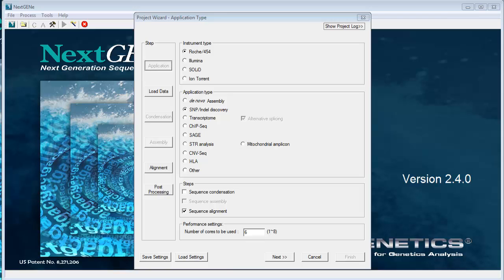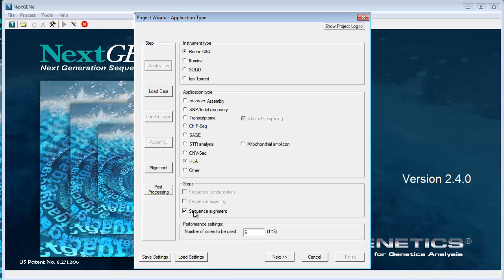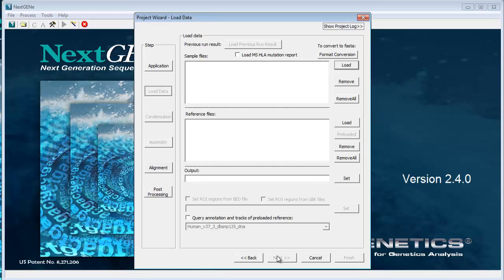To perform HLA typing with NexGene, select the instrument type that was used for sequencing and select HLA under the application type. Sequence alignment is selected under Steps. Click Next to load your sample data.